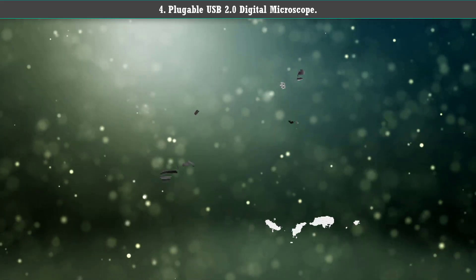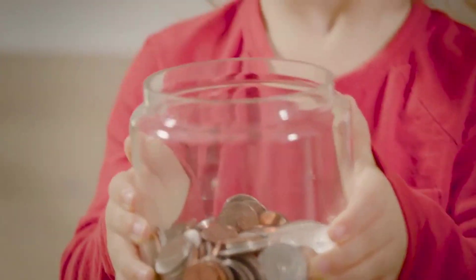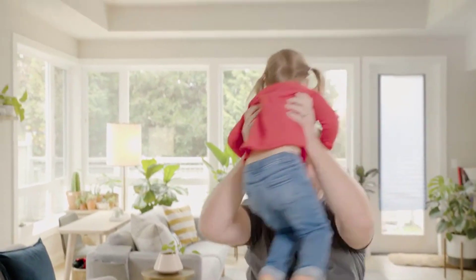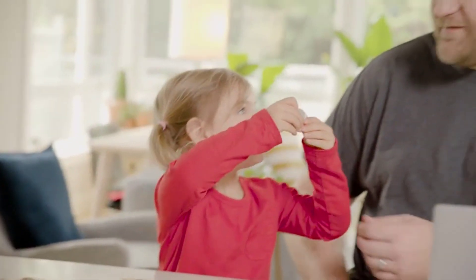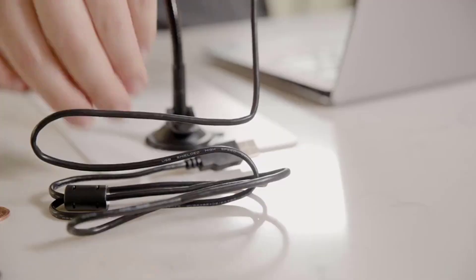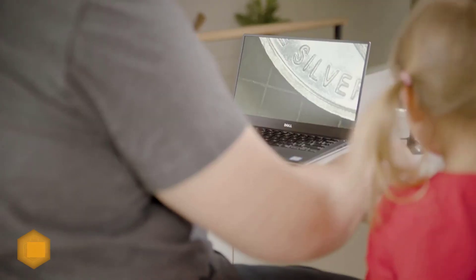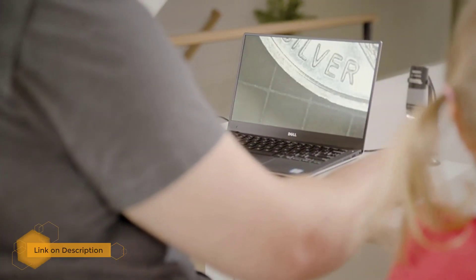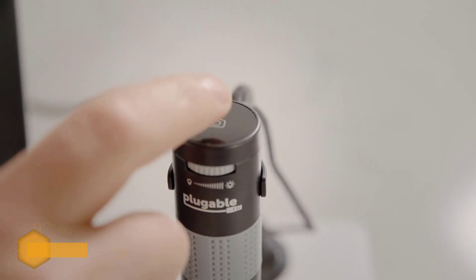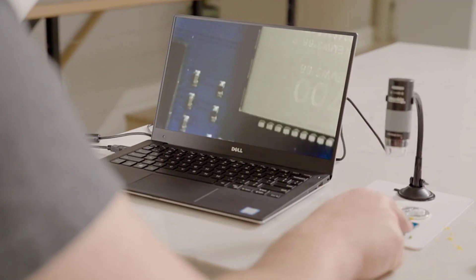Number 4: Plugable USB 2.0 Digital Microscope. This is a plug and play microscope that you connect to your computer via a USB 2.0 port, so you can conveniently observe the specimen through your computer as well as take snapshots. It has a relatively low maximum magnification that tops at only 250x, but that's still plenty enough to let you view various specimens such as rocks, coins, insects, parasites, and so on.